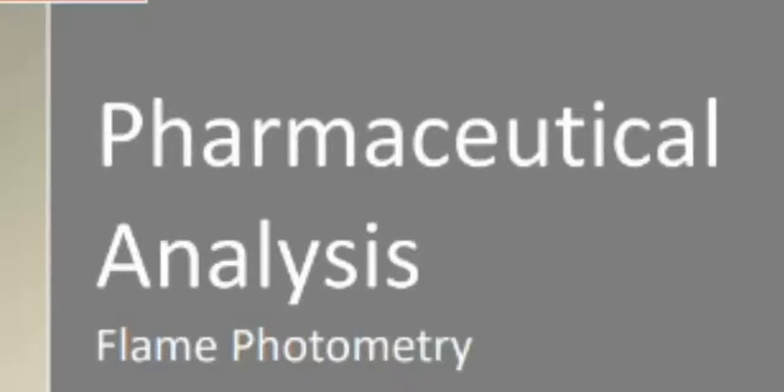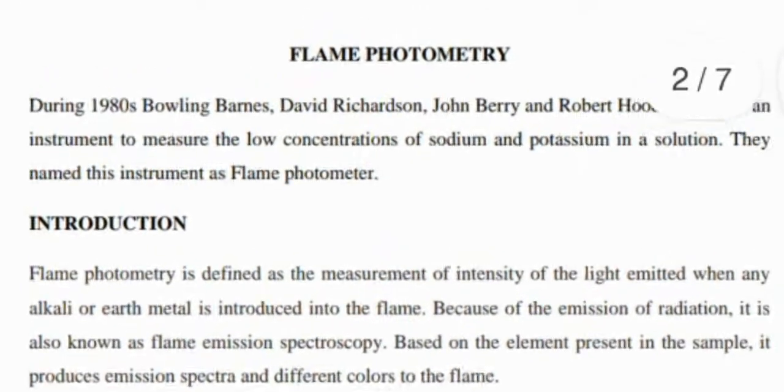So let's start our new video, which is on a very important topic of analytical chemistry: flame photometry. Now let's see what flame photometry is.